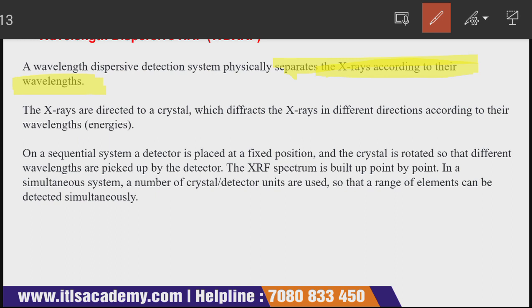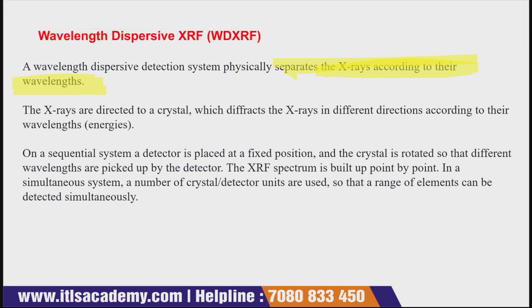The number of crystals or detectors used means the range of elements can be detected simultaneously. Okay, so this is the principle behind wavelength dispersion spectroscopy.